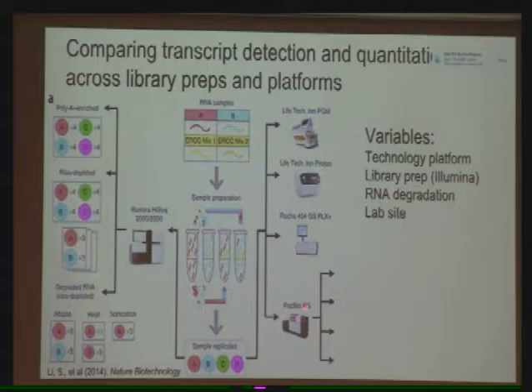So they were sequenced on a PacBio machine, a 454 machine, and two types of Ion machines, and also on an Illumina machine. So they can compare across all those different platforms. RNA sequencing has really expanded in the options that are available for sequencing now. And then with the Illumina, they used a poly-A enriched protocol. So that's going to select for your protein coding genes.